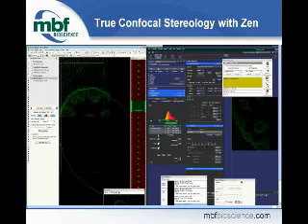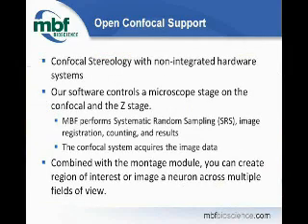So we're going to control Zen within our software application. For SRS image stack acquisitions, we will control the movements of the XY stage, and Zen will control the stage or the acquisition Z stage in order to get the image stacks. If Zen has the controlling hardware, we will go through Zen to move and keep track and be in coordinate conjunction with Zen's coordinate space and use their hardware.